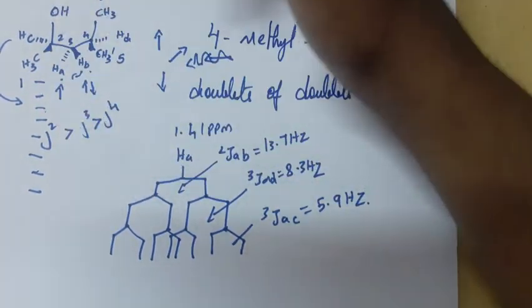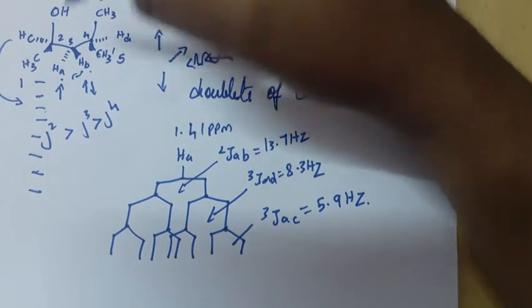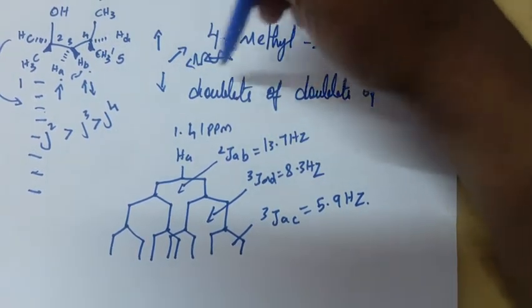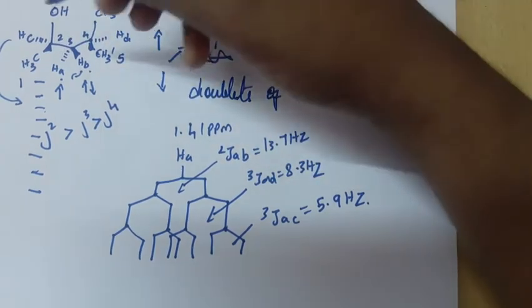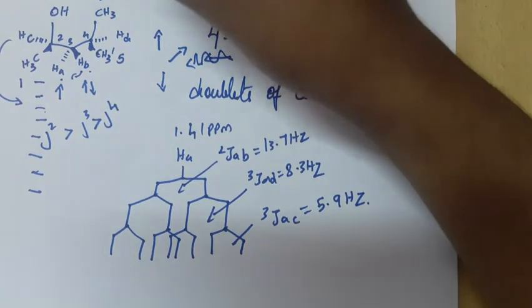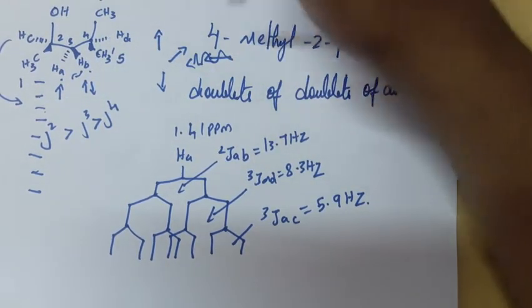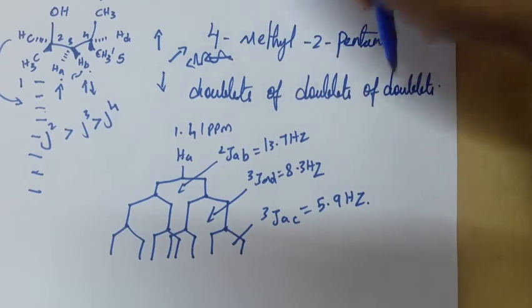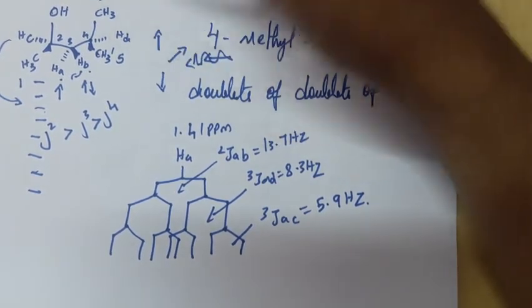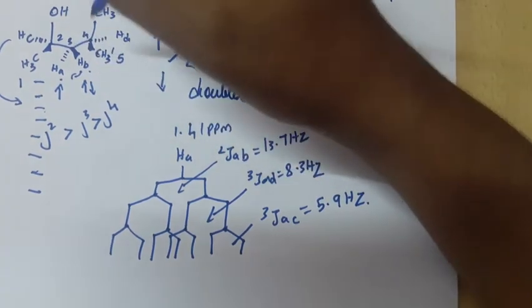So first I'll tell why it happens. I think you got some idea about why it happened like this. If you already have a little bit of idea about NMR, this phenomenon is easy to understand, I guess. I just want to tell why it gives this unique doublet. It's because they have three non-equivalent protons here.